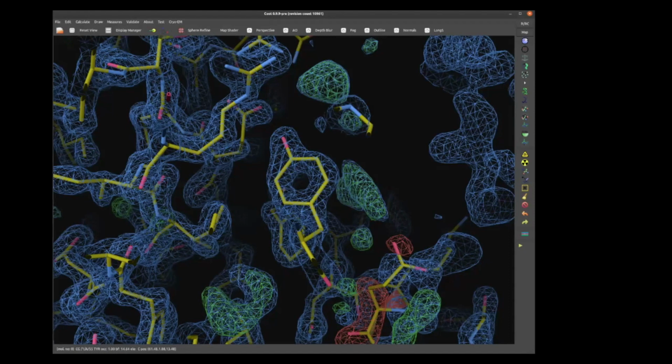If you look closely, you can see that it's got a material property as if it were made of something like Lego, tubes of Lego. The density looks like wool, especially when you zoom out. But the idea was to keep the sort of view where we're looking at the residue scale similar to how it used to be in the old version, because it wasn't too bad a representation.